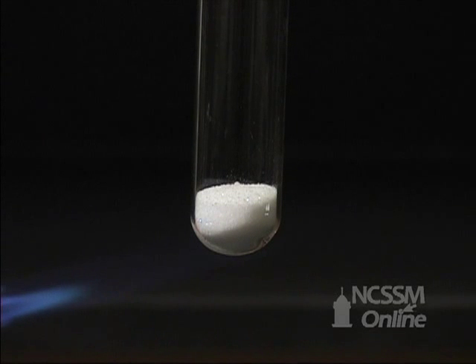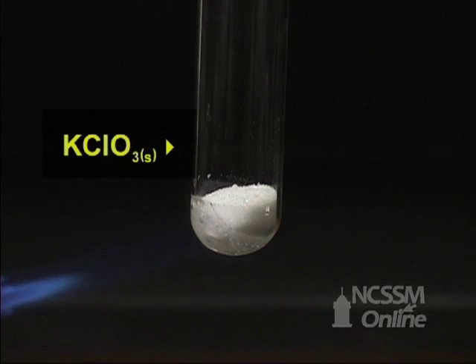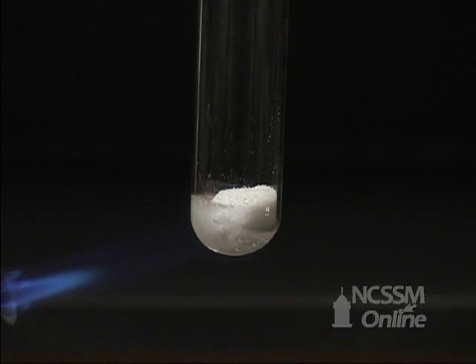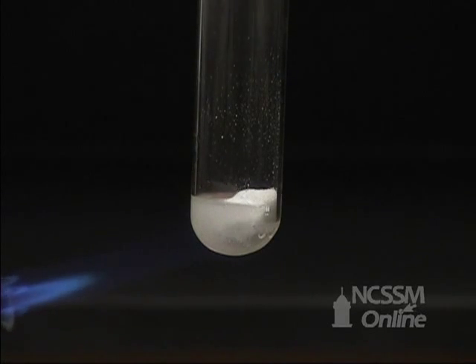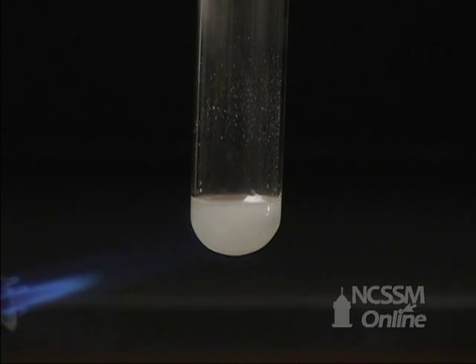Metal chlorates decompose to give the metal chloride and oxygen gas. If we heat potassium chlorate, the potassium chlorate first melts and then starts to decompose. The bubbling that appears is the formation of oxygen gas. The oxygen gas escapes from the tube, leaving the metal chloride behind.